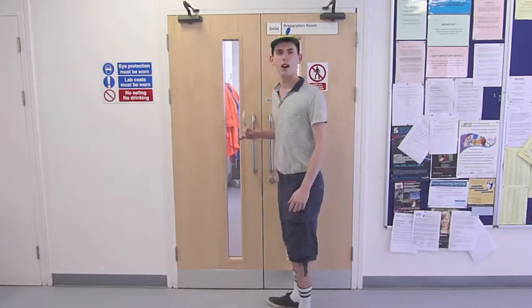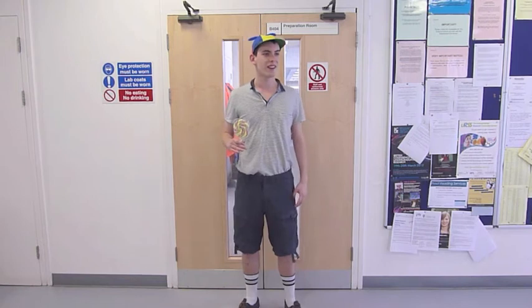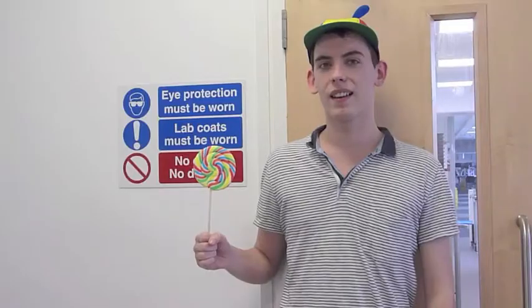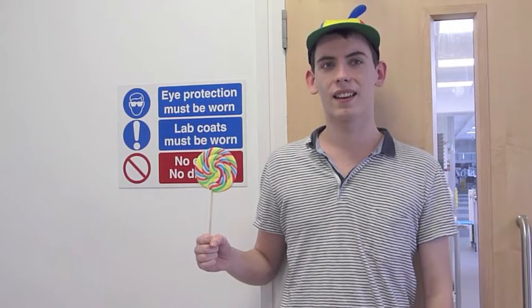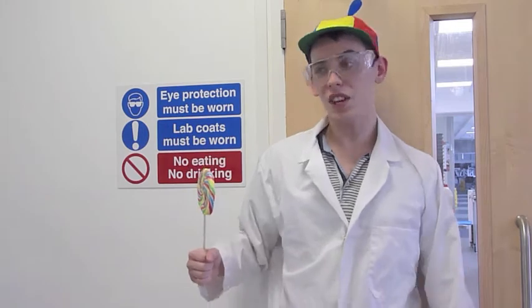Hold on there, kiddo. First of all, we need to get you dressed for labs. Okay, Johnny. Now the first rule of labs is that eye protection has got to be worn. Whoa! Okay, Johnny. Now the second rule of labs is that lab coats have got to be worn in case of chemical spills. Jeepers!